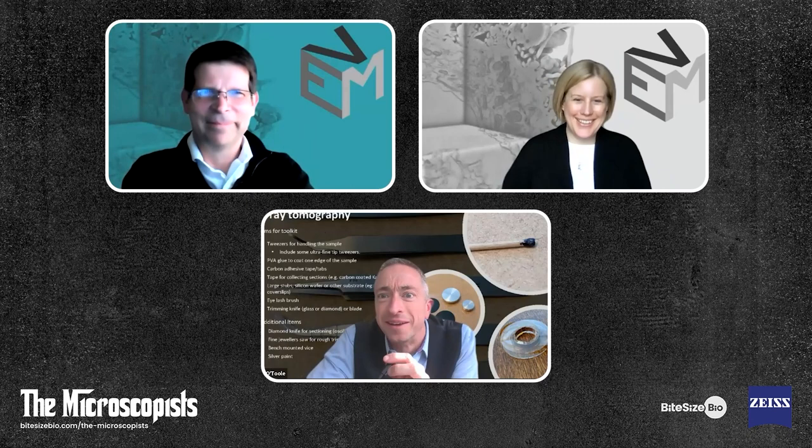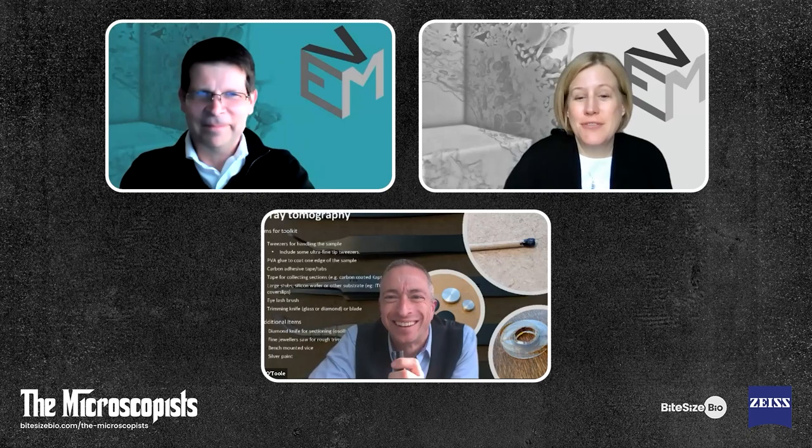So for array tomography, you've got an eyelash stuck to a cocktail stick, which you need to move your sections around your boat of water when you cut them on your diamond knife. You use students to make sure you've got enough eyelashes, because you don't have my eyelashes. So it's always voluntary. We never make anybody give us their eyelashes, but different people have different eyelashes and some are better than others. So Martin Jones, who's in charge of microscopy prototyping in our team, which is much more computational and engineering based, apparently has extremely good eyelashes.